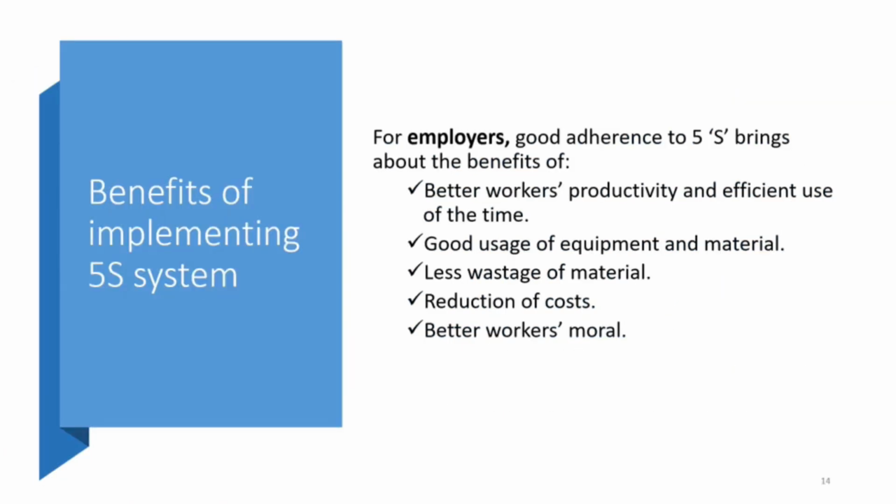For the employers, the companies, the 5S system will bring about better workers' productivity and more efficient use of time. This is because now workers don't need to spend a lot of time trying to locate the things they need, and also because only the necessary things are bought and kept at the workplace, there will be a reduction of cost and also less wastage of material. Eventually, it will bring about better workers' morale as well.